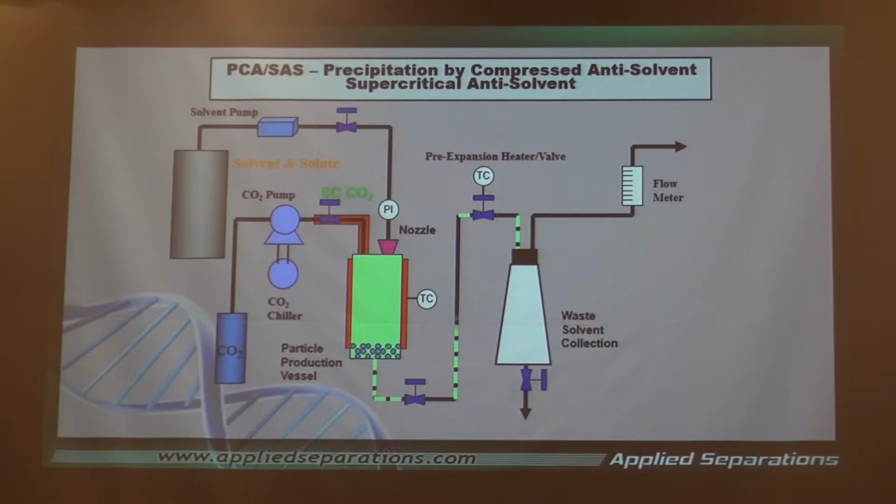So I'm going to throw a lot of things at you, but think about the fact that all of these are ways that you can now control solubility. And this is the important part of this. This is a very powerful tool to be able to use. Wide variety. And initially, when this technology first started being used, when I told you about the decaffeination of coffee, it was really, let's use it as opposed to a solvent.